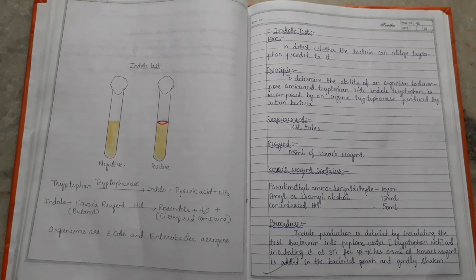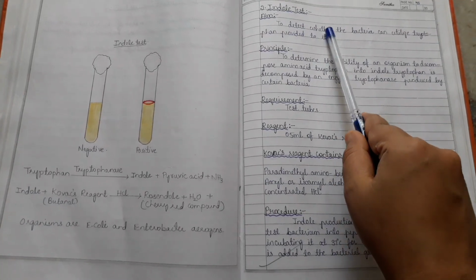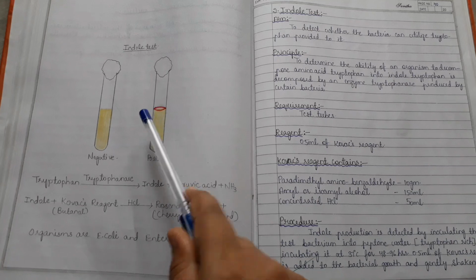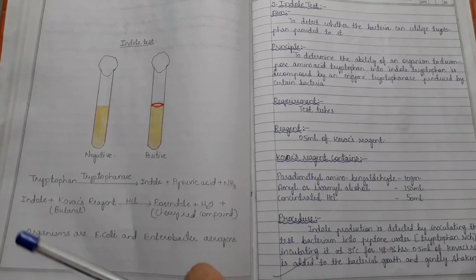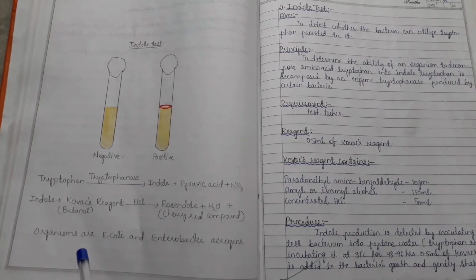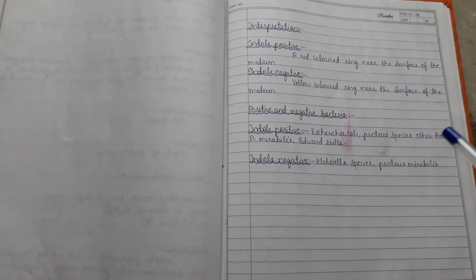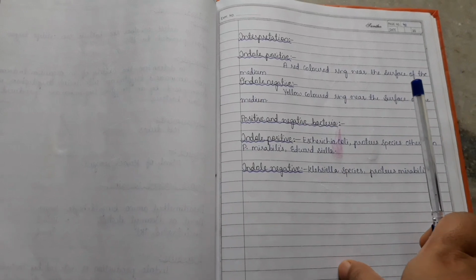So the second biochemical reaction is the indole test, to detect whether the bacteria can utilize the tryptophan provided to it. So this is the negative test, and this is the positive, where we can see the red color ring. So this indicates indole positive. This is the reaction of the indole test. Yeah, principle and procedure. So yeah, these are the positive and negative bacteria for the indole test.